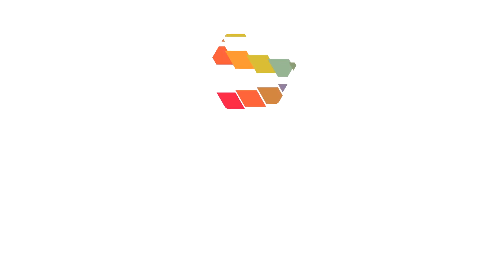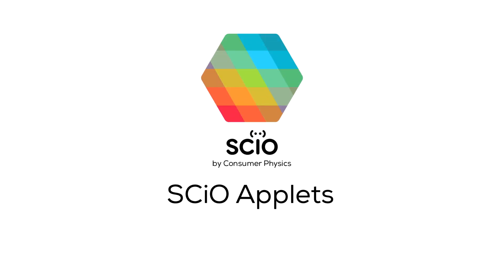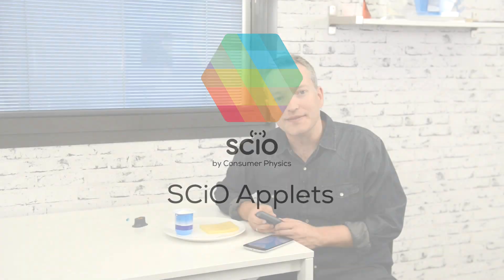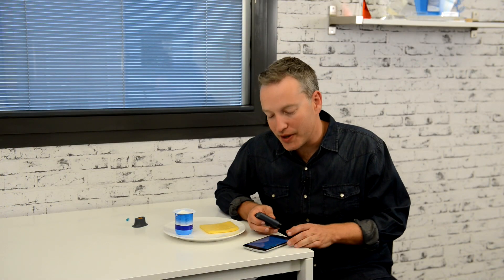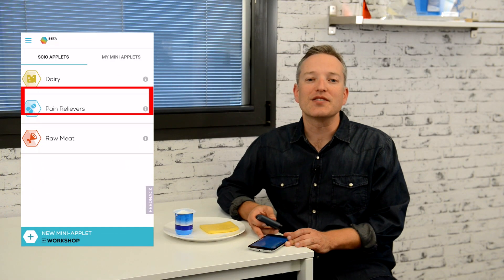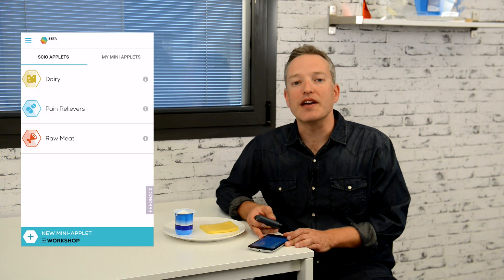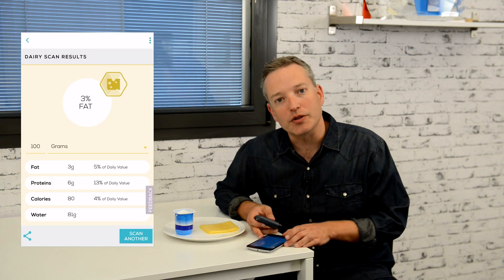Hagai from Consumer Physics here to show you the SCiO Applets. On the home screen, you see the SCiO Applets. Each of these applets provides you with a variety of insights about certain material categories. We're releasing more applets periodically.